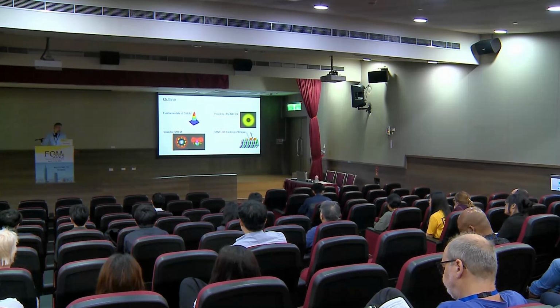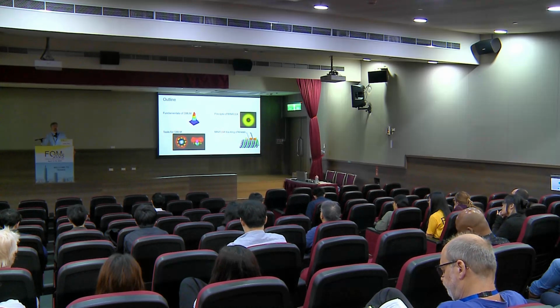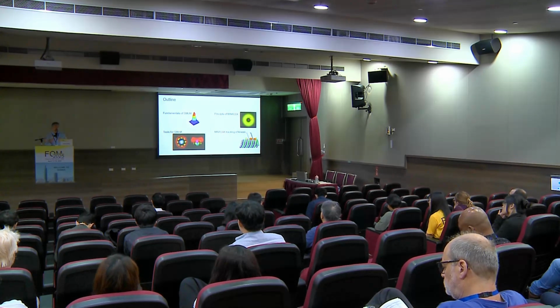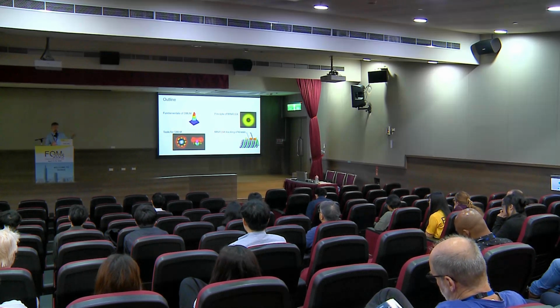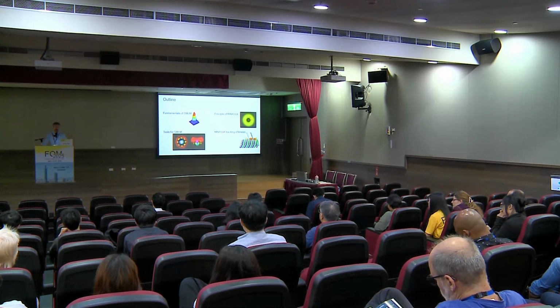If you use something like DECODE, of course you need to know more parameters. You need to know the approximate density of localizations, the approximate background, the approximate brightness. And for this, typically we do a SMAP fit, a standard single molecule fit before, to estimate the range of these parameters. But it's not very crucial. The only thing that really matters is the precise point spread function model.